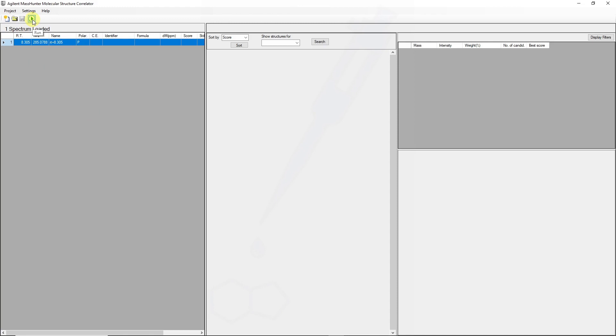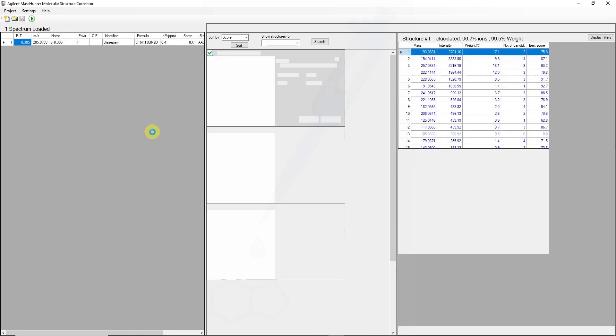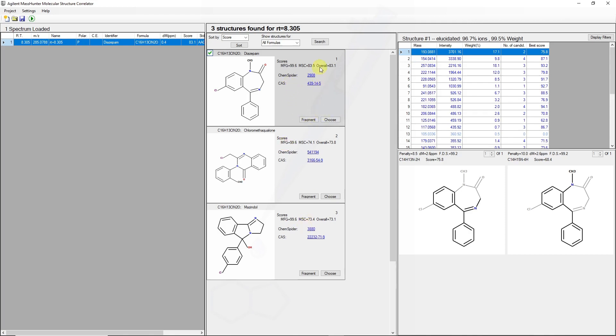If I hit the Run button, I should get a result. And in this case, those three formulas were transferred from the PCDL, because the software was able to calculate the correct neutral mass from the information provided in the MS-MS spectra. You can see these are now ranked based on score, and we can see the overall scores 83, 73, and 73 have been associated with each of these molecules.